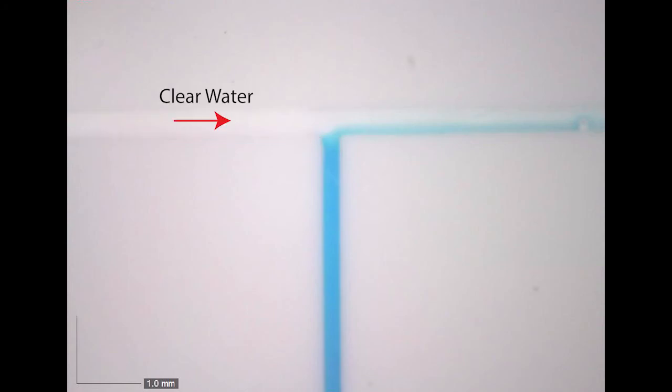Clear water flows in from the left-hand side of the chip while blue dyed water enters from the bottom, forming an interface at the intersection of the two channels.